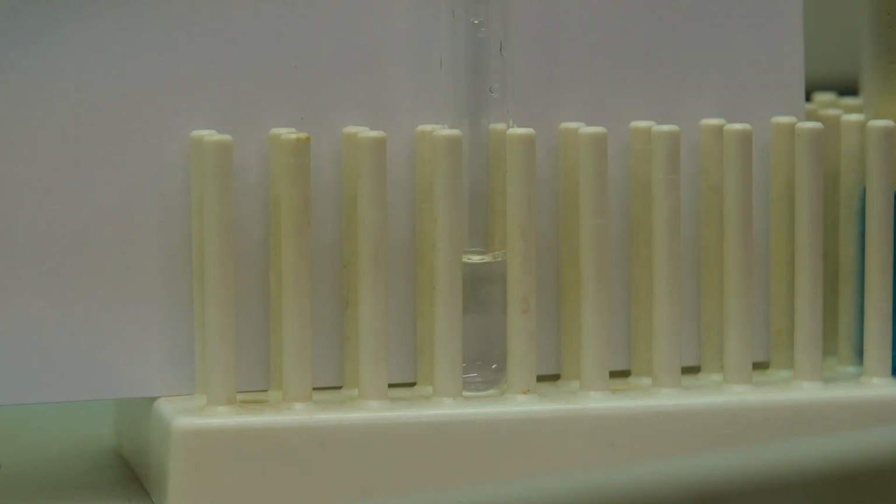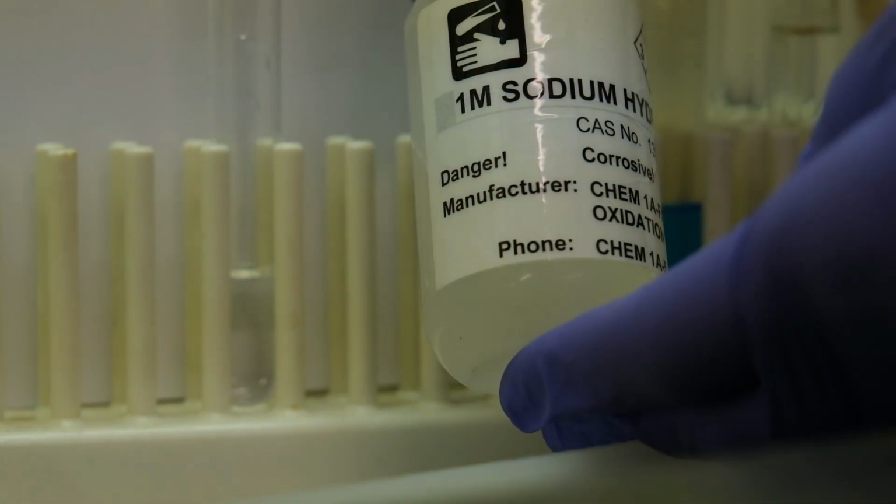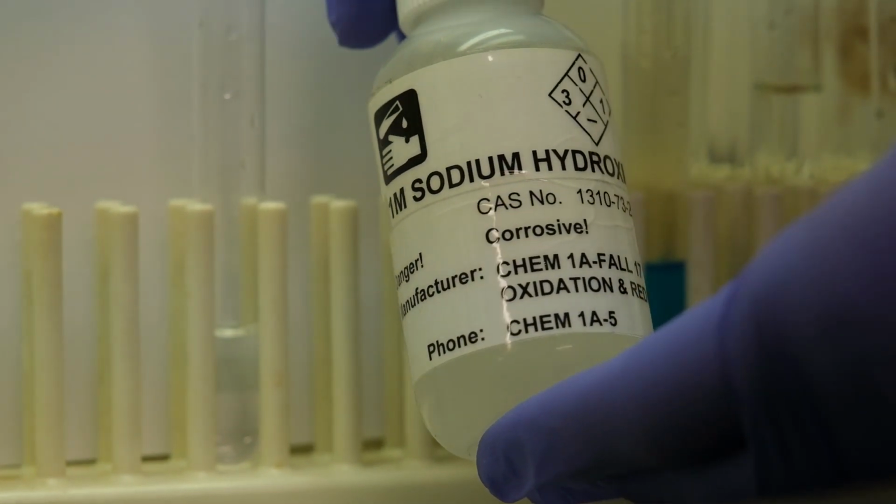Now we're going to add 2 drops of the 1 molar sodium hydroxide.